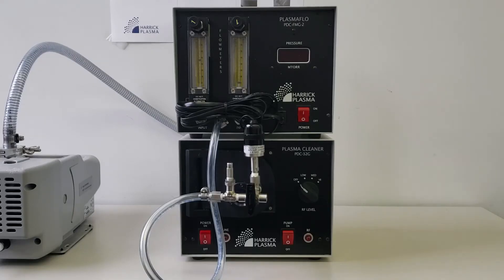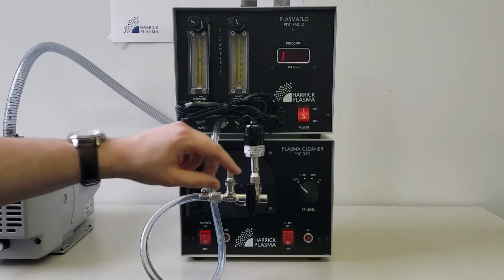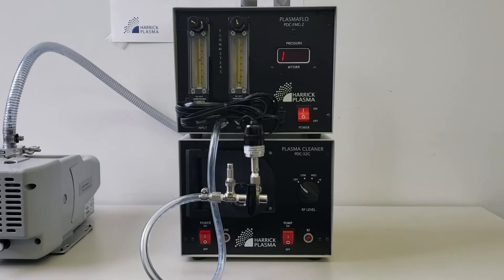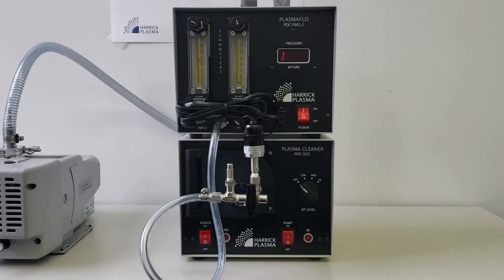Turn on the plasma flow device and the plasma cleaner main power. Make sure the three-way valve is pointing down to isolate the chamber. Close the metering valve. In the future, the metering valve can be kept at the same position to achieve the same vacuum pressure consistently.